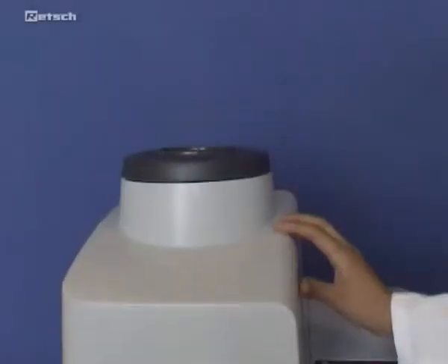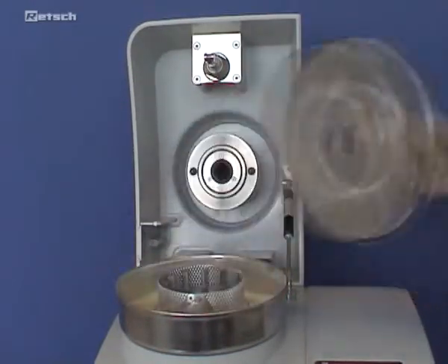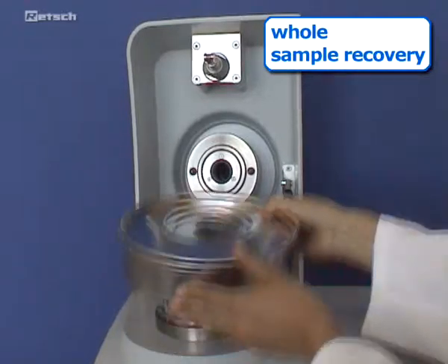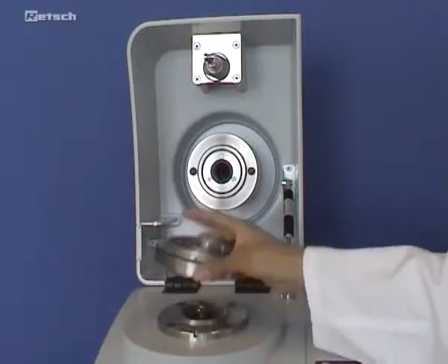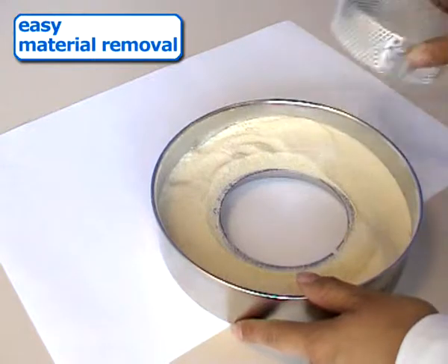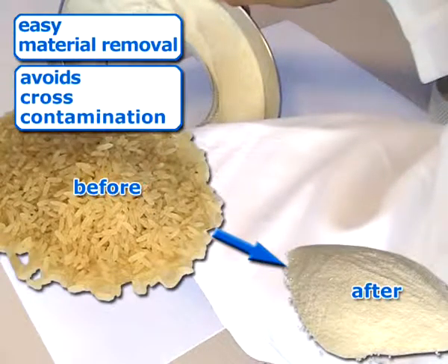After the grinding process is completed, the cassette can be taken out together with the sieve so that, different to other centrifugal mills, the whole sample can be recovered. All grinding components can easily be removed for cleaning. The innovative and patented cassette principle ensures easy material removal and avoids cross-contamination. The daily output can be several hundred samples.